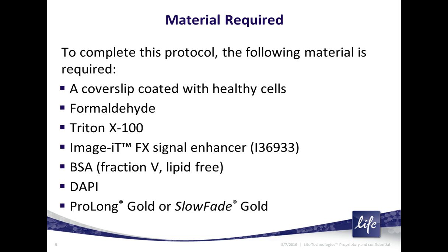The signal enhancer that I'll talk about. Blocking solutions, such as BSA, or that's bovine serum albumin, or normal goat serum or other serum. Counterstains, such as DAPI. DAPI is a nucleic acid stain that's commonly used. And then an antifade mounting medium, such as our ProLong Gold or SlowFade Gold. And I'll talk about each of these separately.